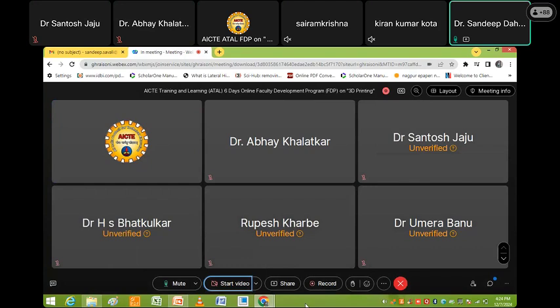There you can not only design the particular implant, but also give all the material properties, select the element size, and directly create a finite element model which you can further use in the ANSYS software.